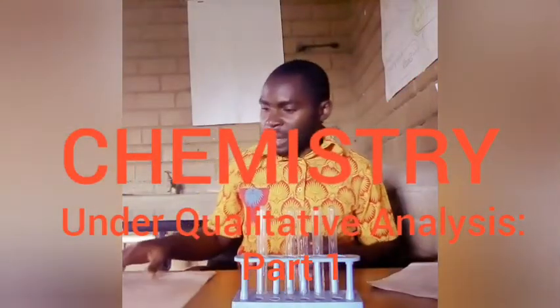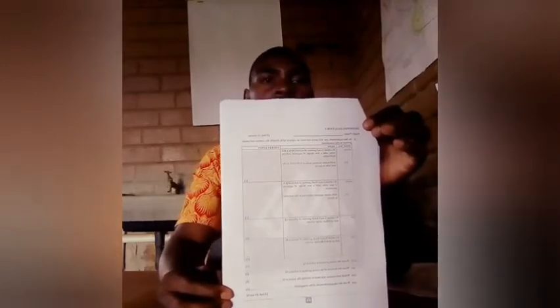In this experiment, I will be able to carry out a test on solution Q to identify the cations and the anions present in this compound. In order to do this, I've got a guide, some questions that I'm supposed to answer. So these are the questions that I'm going to answer. If you have got them, you can pause this video and try to go through these questions so that we go through them together.